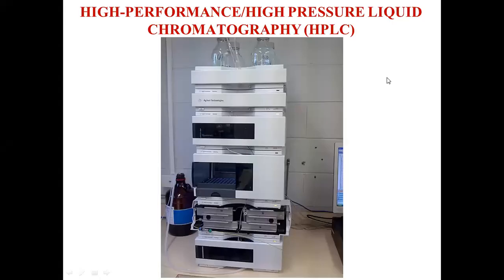Chromatography. You know the principle of gas chromatography, right? So what is the principle of gas chromatography? The compounds are going to be separated in gas chromatography by using either a solid or liquid stationary phase and a gaseous mobile phase.